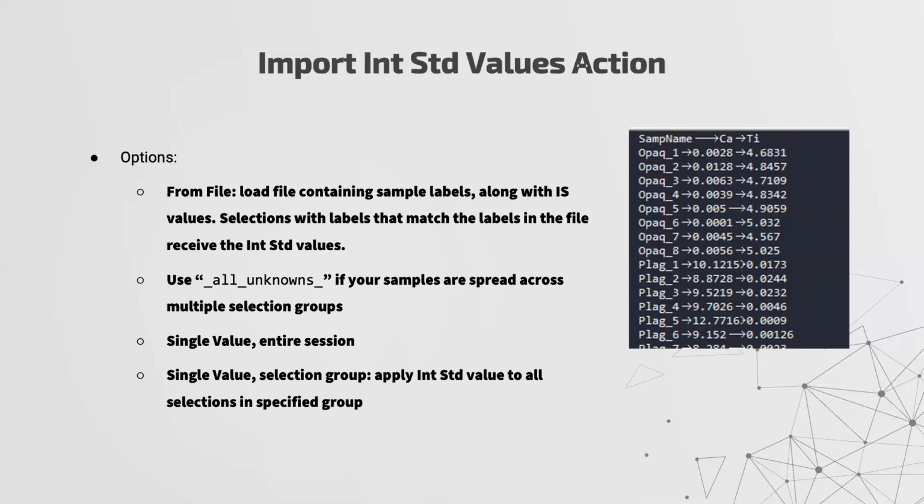If you do, and we'll do this later, spread out your unknowns across multiple groups, when you run this from file option, you can use this all unknowns option, so it'll look in all your unknown groups to try and find matches.